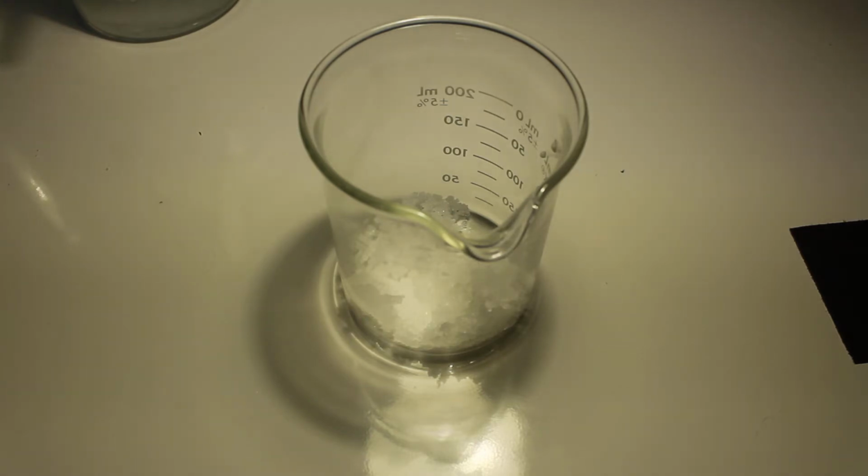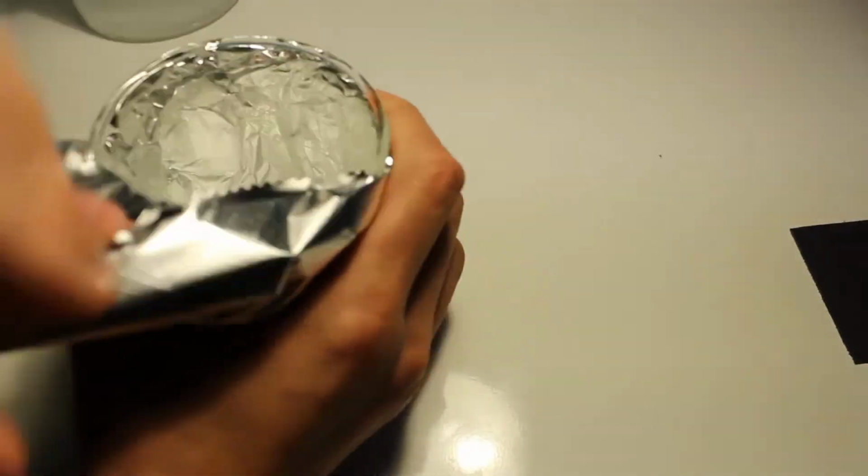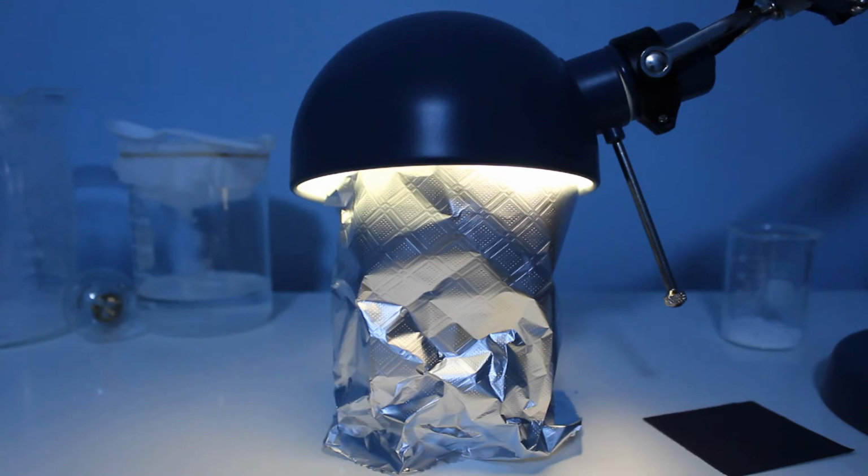And since I don't actually have a dryer, what's going to have to suffice is an incandescent lamp and some tin foil. Weird looking setup, but it does what it's supposed to, so I'm gonna keep it. I'll probably get something better later on, but for now, this is what I have.